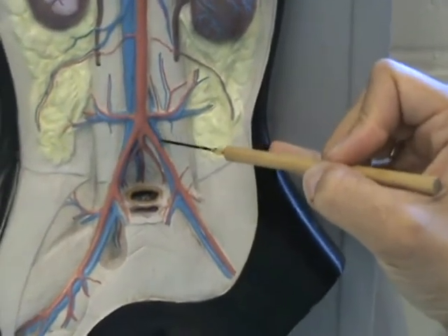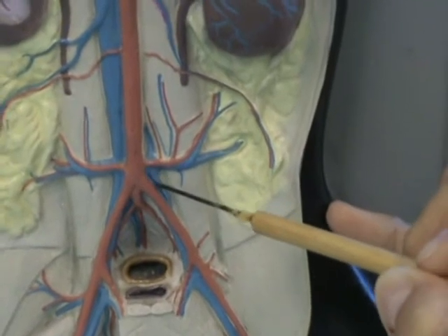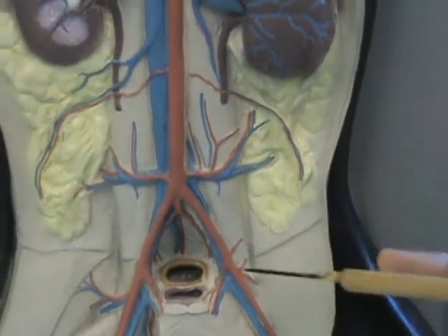That would be the common iliac right there. Let me lean in real quick so you can see that. It has a pen mark on it if you can see it. It's on both sides. All right.